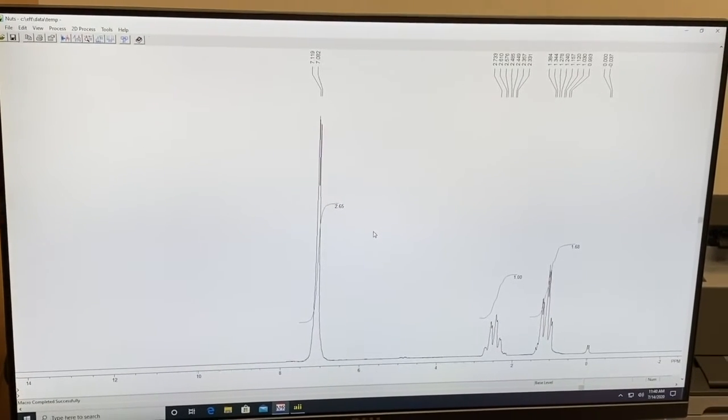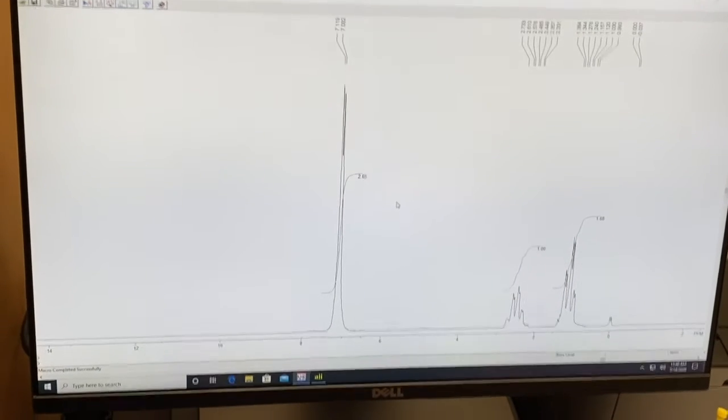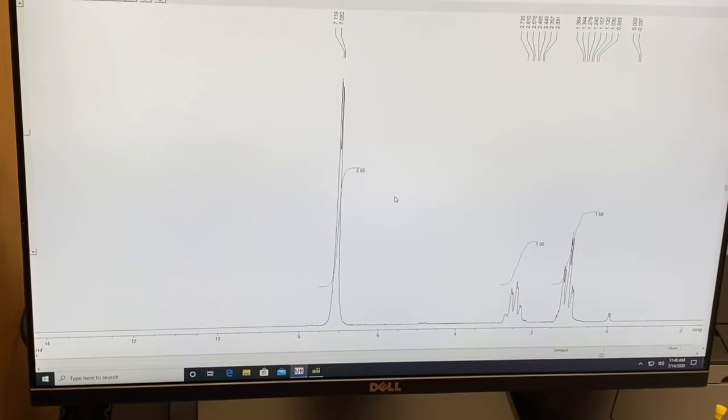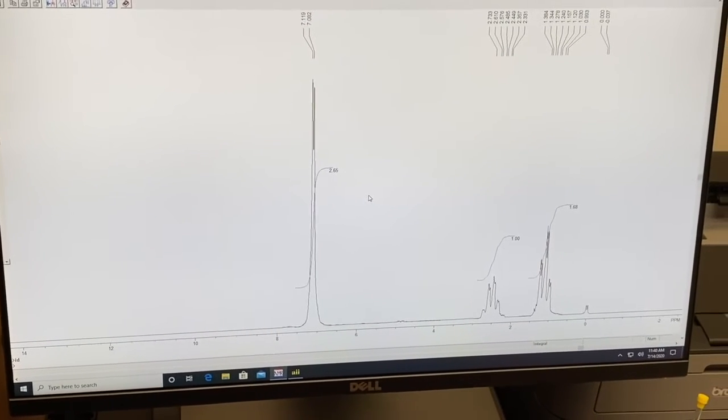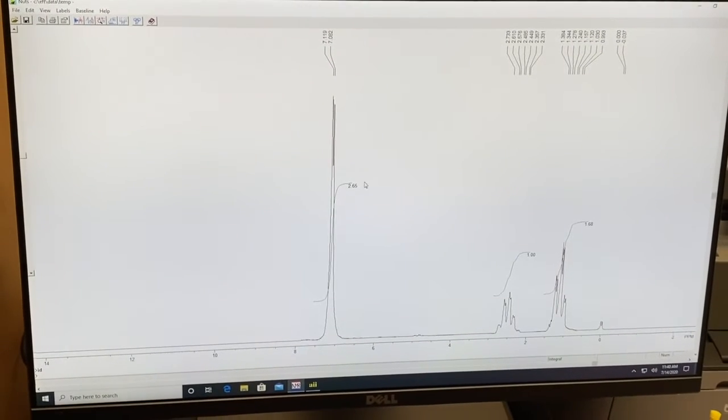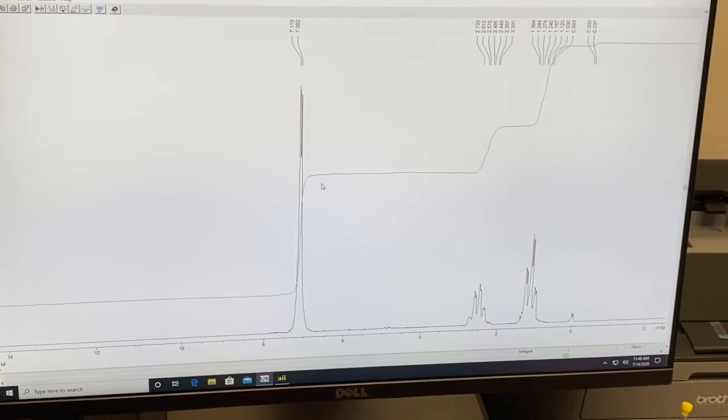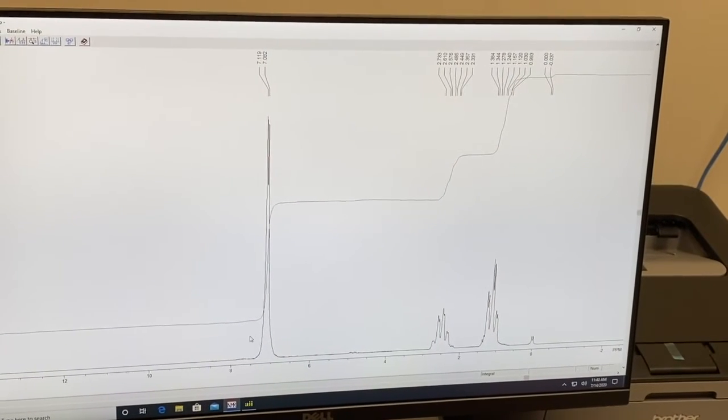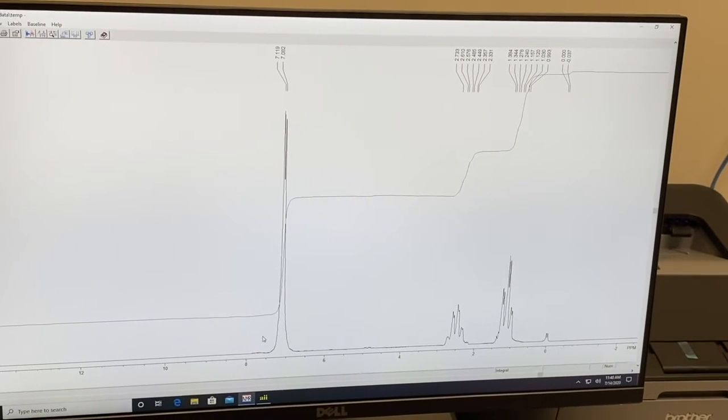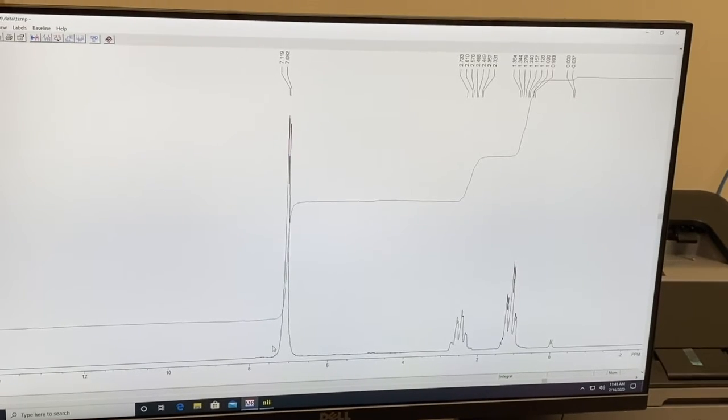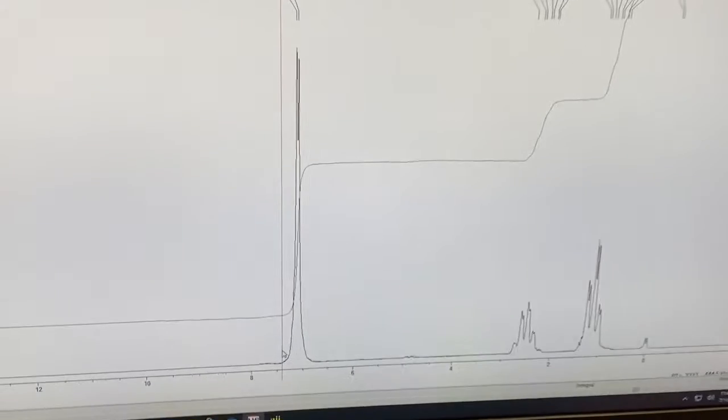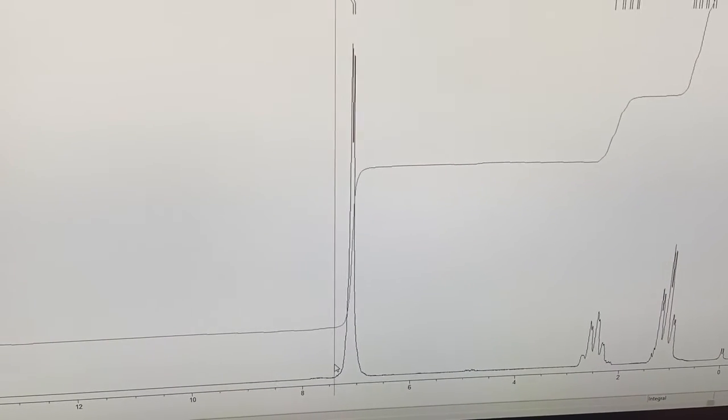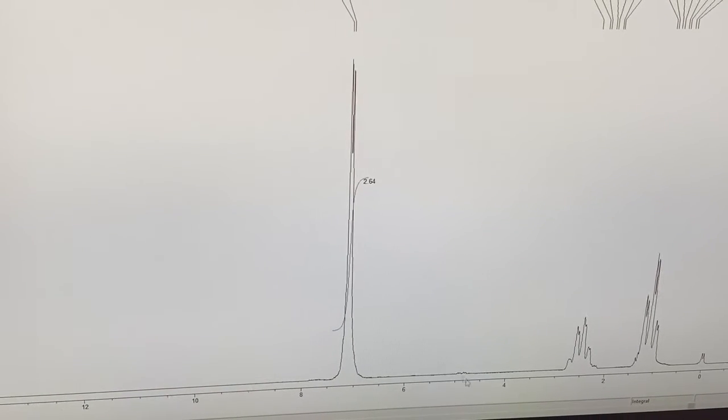The first thing you're going to want to do is enter integration mode by typing in ID. Don't hit enter in this program because it will kick you out of the integration mode. Now we're going to clear the computer set integrations by typing in C. Now what we have to do is take and section off each peak on our own. You'll take your cursor and go to the left side of the peak you're interested in, click it one time, and you get a vertical line. Click on one side of the peak, click on the other, and that peak is now sectioned off.